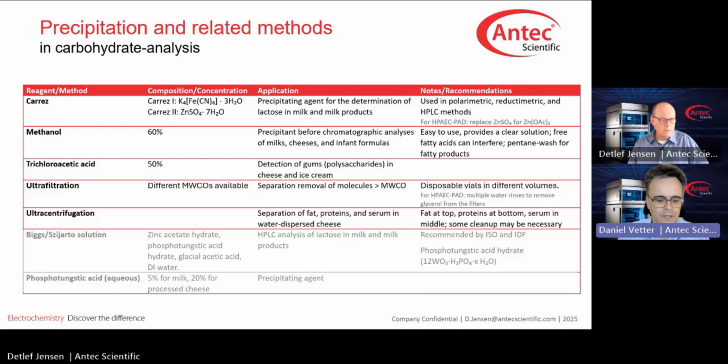Sorry to interrupt, Lev. So this organic solvent you mentioned, methanol. This is the alcohol methanol, and carbohydrates are polyalcohols. Correct. And so can methanol interfere with the detection? The answer is yes, because methanol is an alcohol and carbohydrates are polyalcohols, as you rightly pointed out. And does it interfere with the analytical determination of carbohydrates?